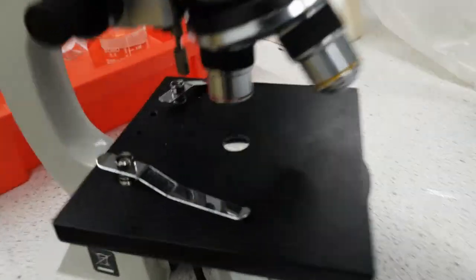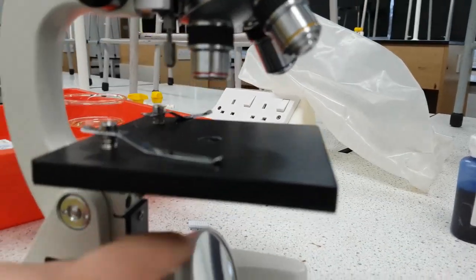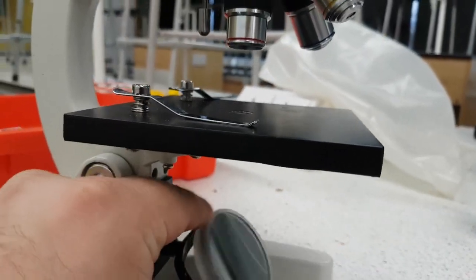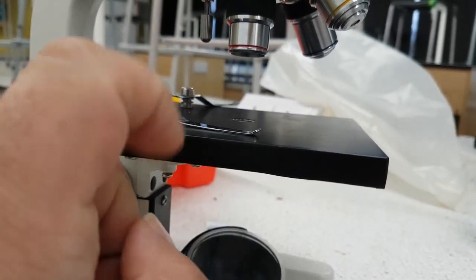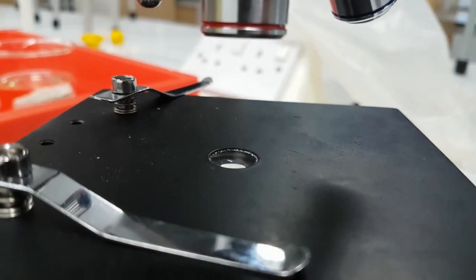Now these types of microscope are called light microscope because we use the light, reflected light, to go through, reflect off the mirror and go through this area here where you can focus the light.